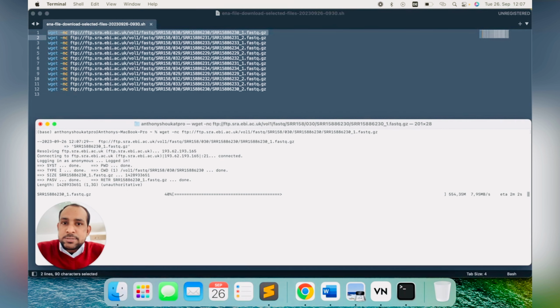So in the next part, we will do the system setup where we install the different software that we need to do the analysis. And after that, we will officially start our analysis. So we are spending a lot of time on preparation, but it is required.